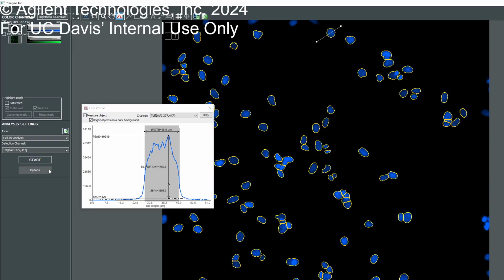So you want to be cognizant of everything that's happening in this well, but also for the whole well thing. And you can only do that if you just look at the averages. That's why this 25% number is very helpful for you, because if you type that in, it's going to basically compensate for the most part of this image. And once you collect the whole plate images, you can always go back and change it. So if you see that there are some wells that have some issues, you can always reset your threshold accordingly.